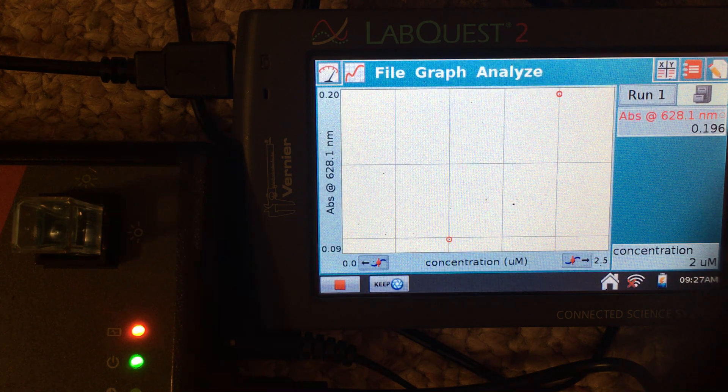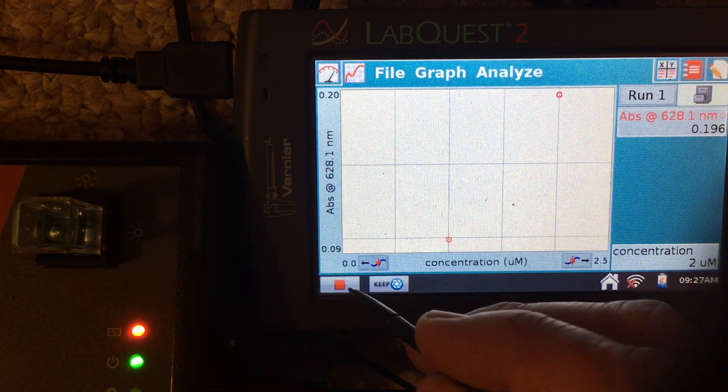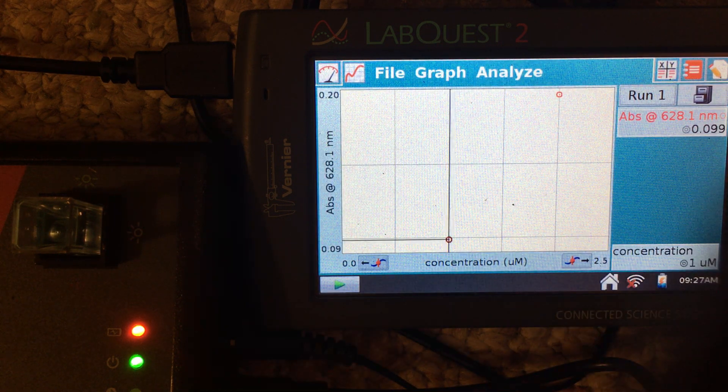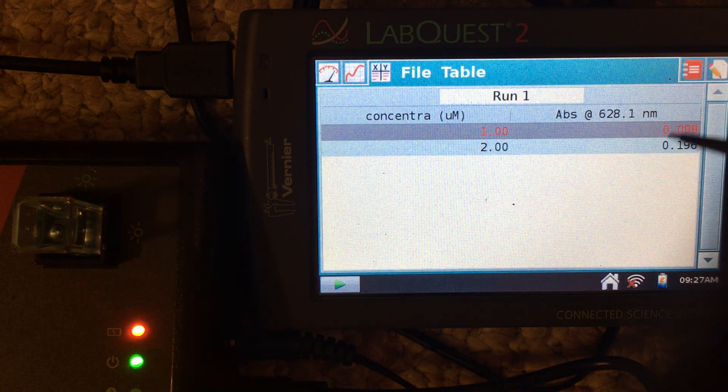We've entered those two values — that's all we're doing for this demonstration. In your case, you'll be collecting many more points, but once you have all the standard data points collected, click the red stop button to finish data collection. You can then go to the table tab and write down the absorbances and concentrations for these data points.